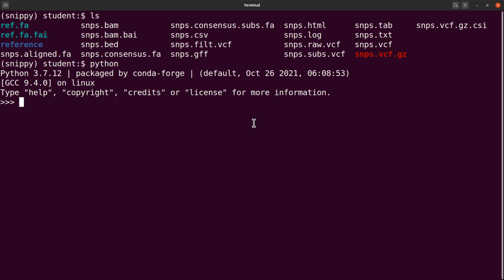So one of the popular libraries is pandas. That is what we are going to use to explore the data. So let's use pandas. We have to import it. So we say import pandas as pd. We are importing pandas, but we are also giving it another name, an alias. We are just giving a shortened form so that we use this for our work. So let's run this. So we have imported it.